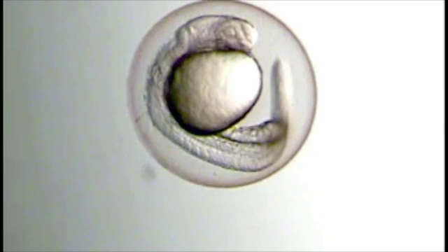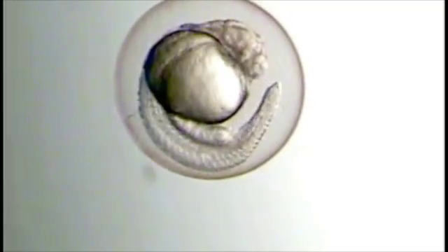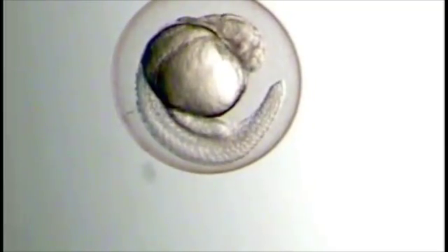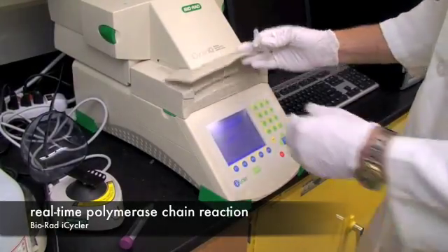A single mature female can produce over 100 embryos in a single week like the one you see here. These embryos develop incredibly fast and remain optically clear during development of the major organ systems.